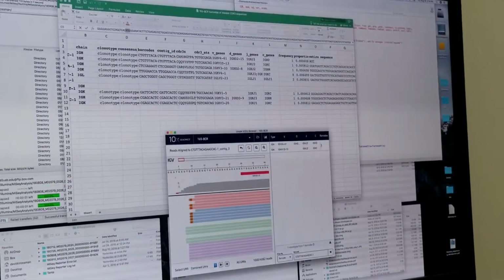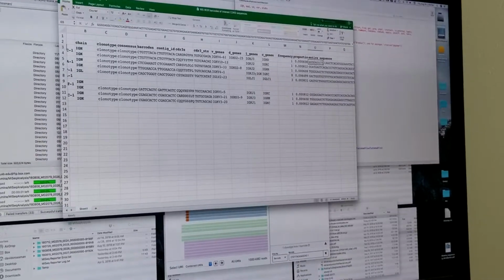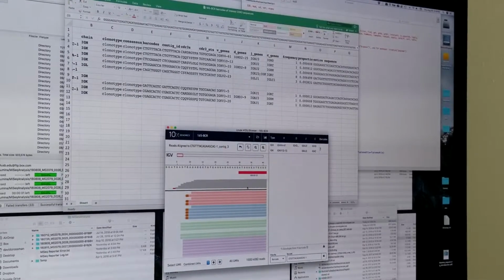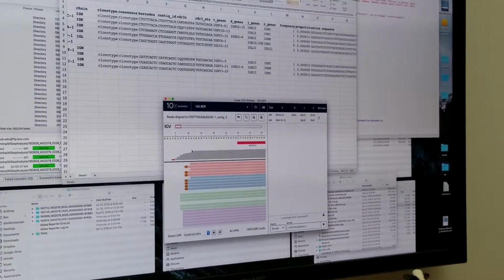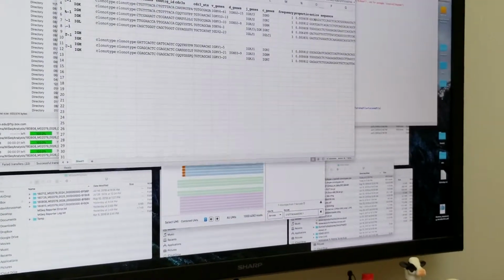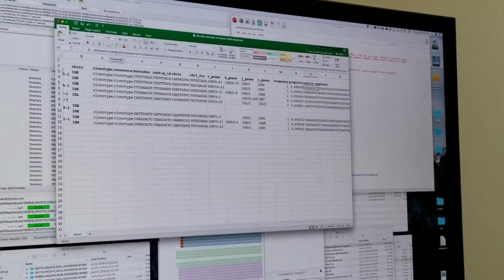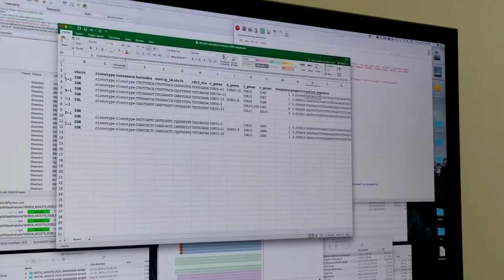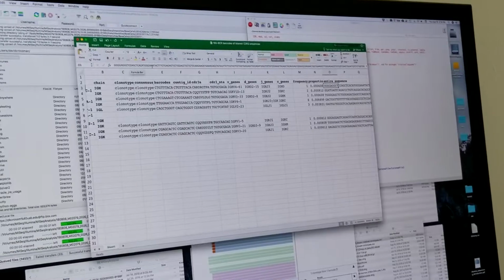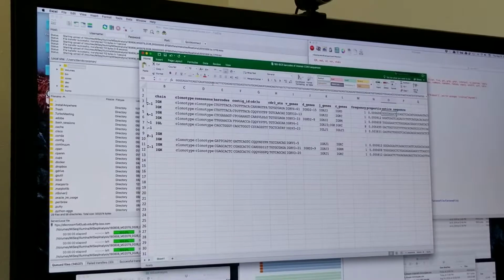I'm at the very front end of this, and so I pulled down the sequence, which is up here. That sequence is this entire length of sequence here with the mutations in it included. And so you would just have to come over here, and here's the ATG, so GAC. So I'd have to come up here and look for it. I'd put it in Word or something to make it easier to look for. But I'm sure there are ways of putting this in a tool and saying, hey, find me the start codon, find me the end, and there's probably something. I just don't know. Well, Greg would.